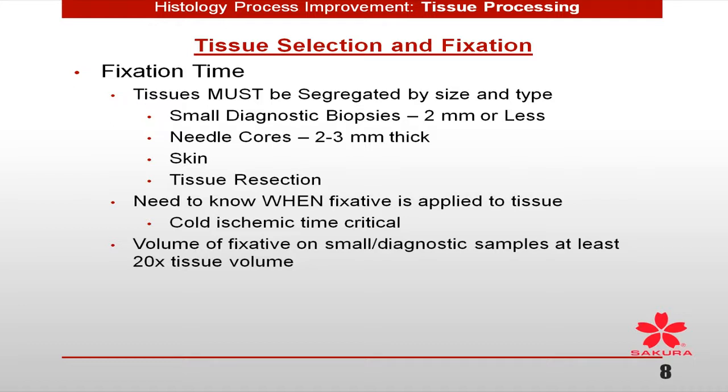I very much feel that how long it takes between resection or extraction from the living body and getting into your fixative will absolutely and greatly affect your performance. Go buy a $250,000 instrument, but if you don't have that part of the process controlled, you're going to see all kinds of variation.